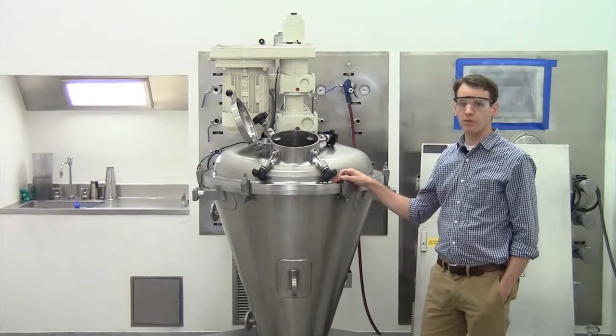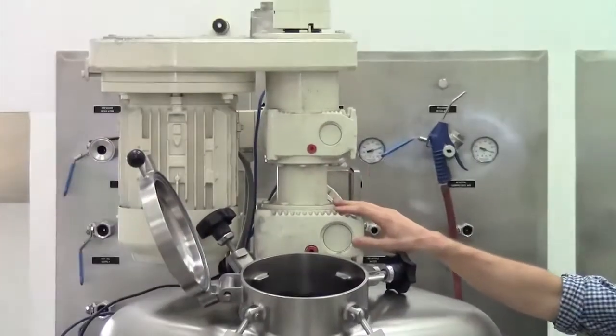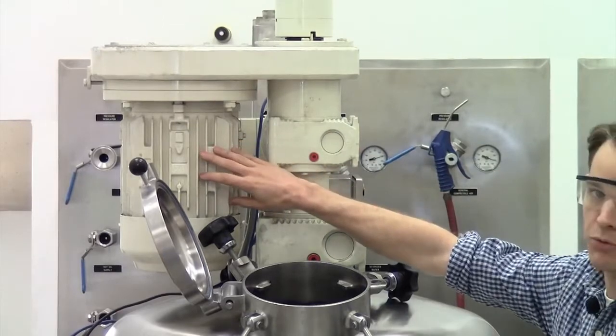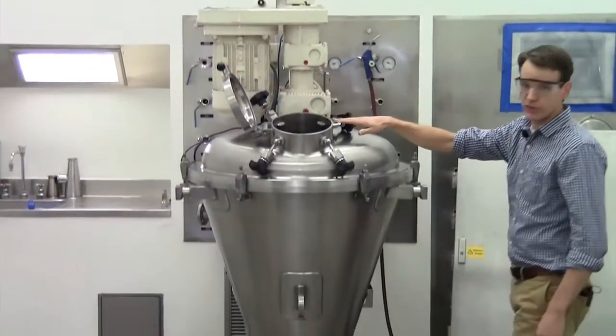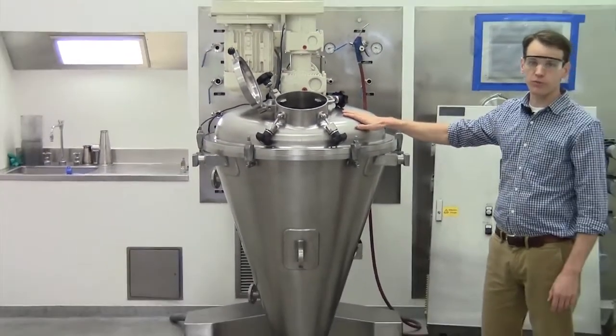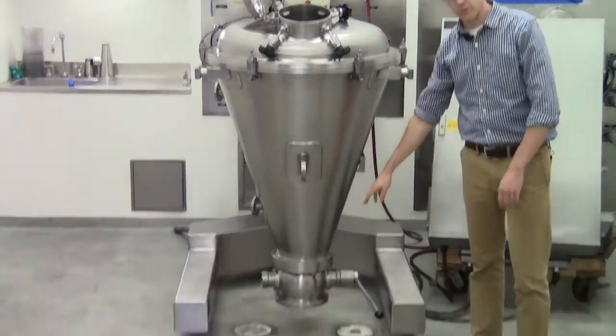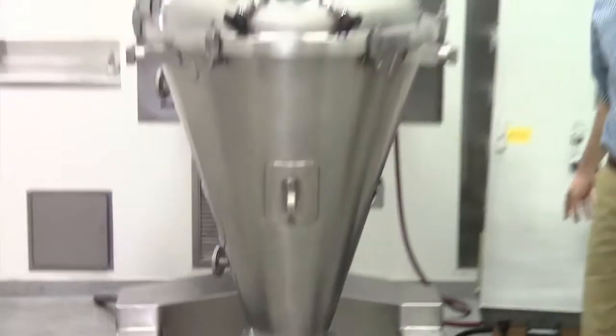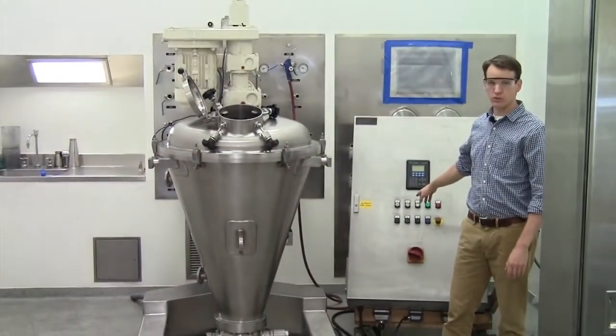Looking at this unit from the top down, you've got the drive up top with the motors for the auger, the orbital arm, and the intensifier, which is an optional piece of equipment. Moving down you've got the mixer vessel, which you would fill with the powder, and at the bottom you've got your discharge valve, which is an isom ball segment valve. Behind me you have the control panel which we'll be using to control the unit.